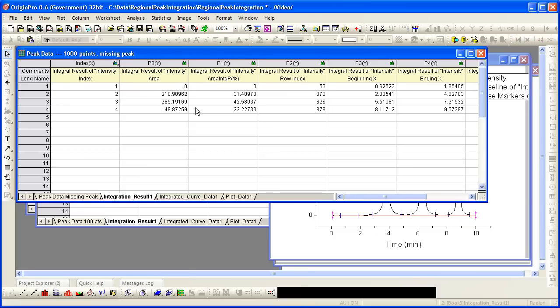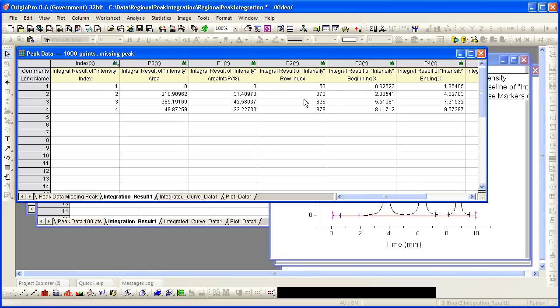And the data reflects what it should, namely that the first peak has an area of zero, the other peaks have the same areas as before, the same row indices of the peak center.